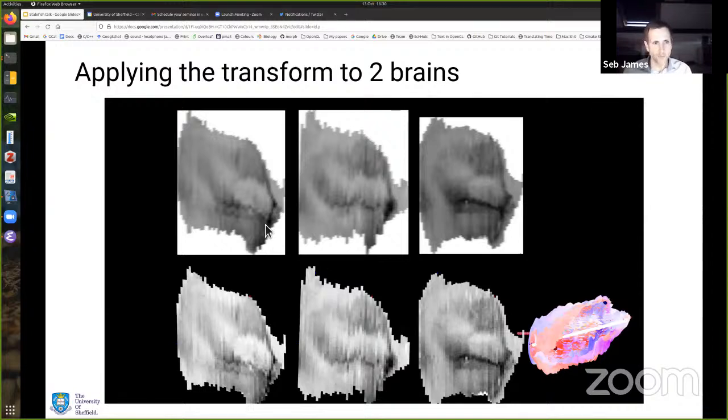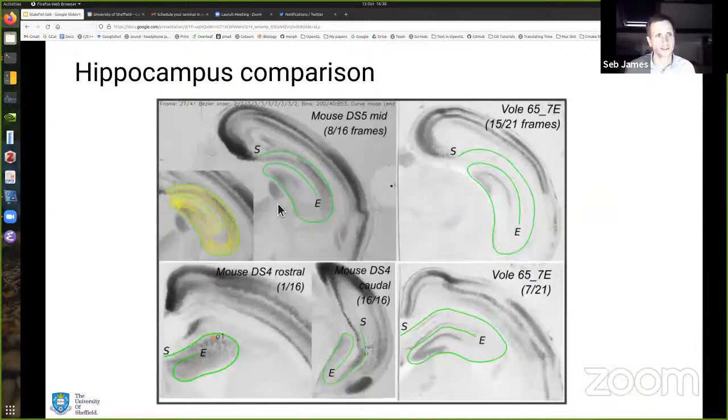And then when you look at the resampled maps, you can see that this region of high expression is repeated in the same location on all three maps. So this gives us the opportunity to take these three images and do correlation analyses on them, and we're confident they're in the same coordinate system. Okay, so that's coordinate systems looked at.